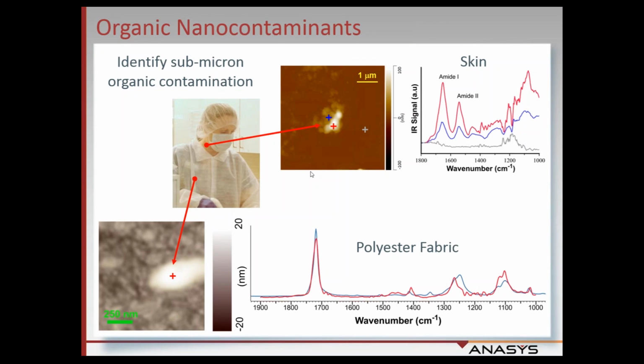And in the production of these electronics, if you have particles or dust on the sample, it can compromise the performance of the device or make it such that it doesn't even work. So the semiconductor and data storage industry and optical display industries are very heavily focused on identifying the sources of contamination on their substrates.